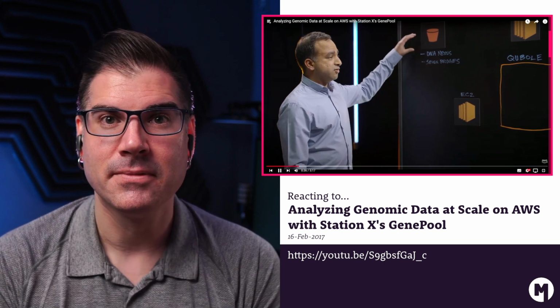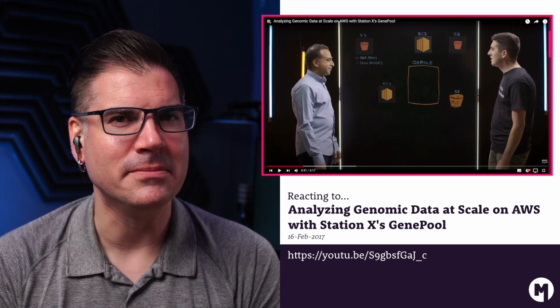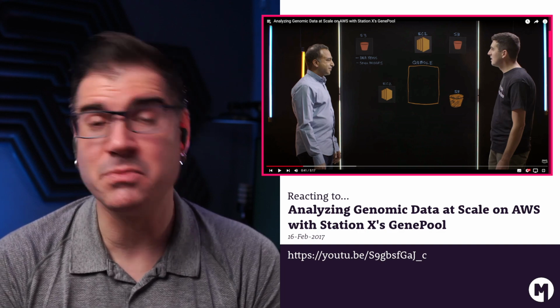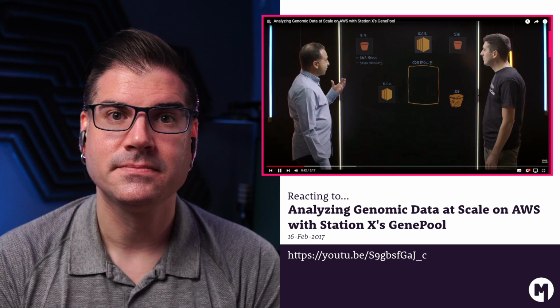Sequencers now stream the data directly onto S3. Oh, very cool. So sequencers themselves actually support S3 as a target? Exactly. That's super cool. Having the sequencers dump directly to S3 saves a whole bunch of steps for the scientists, who may not have the IT support or the cloud knowledge to set this up themselves. And that's a very raw form.